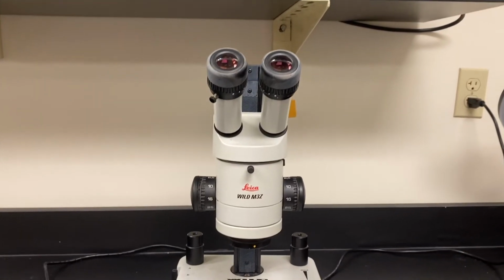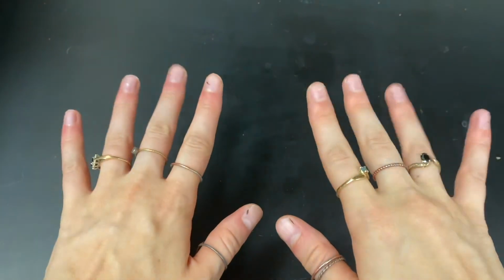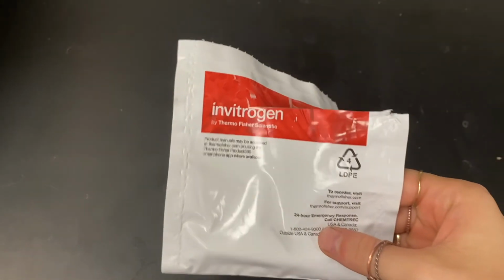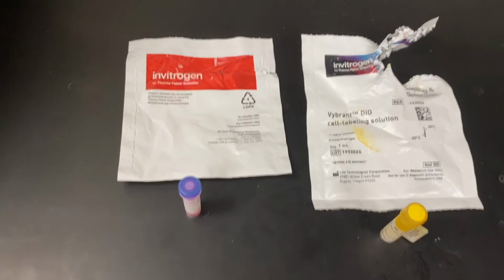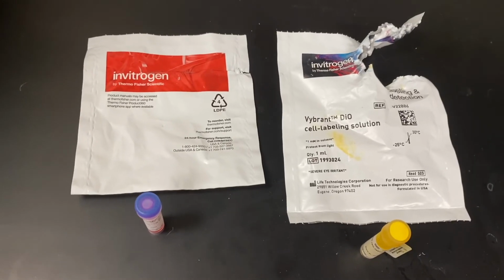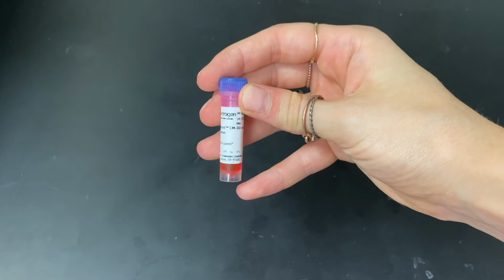This time, I'm going to use a dissecting microscope to help me apply the dye. I also took off my crazy nails, and some more DiI arrived in the mail. The yellow was a few years old, so I'm excited to work with something a little newer and hopefully a little better. Also, this one will fluoresce in more of a red spectrum, so I'm excited to see that color under the microscope.